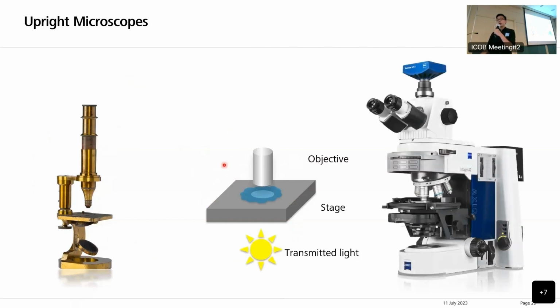Nowadays, we have just changed it a little. You can see we have some fancy stuff like digital cameras, which are made with a CCD or CMOS chip, or this automatic stage, so you can do position settings and automatic workflows. Also, we have the fluorescence filter set. You can choose to image your labeled samples with channels like DAPI or Alexa.